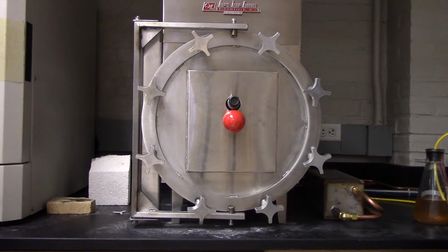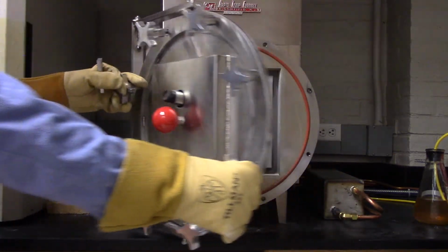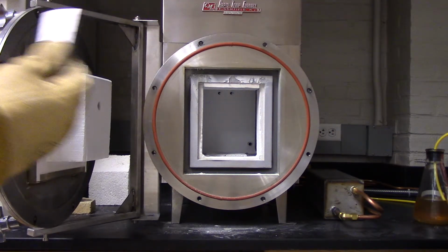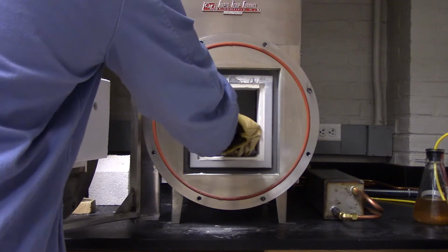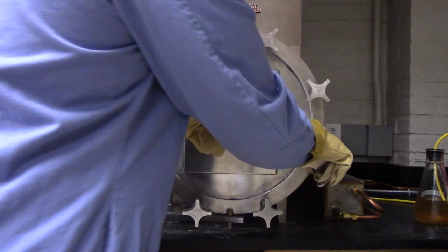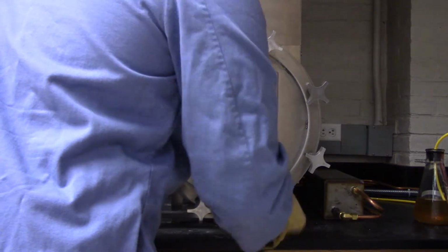So now that we've pretty much finished designing what process we want the furnace to take, we're just going to, following safety guidelines, open the furnace and put our piece of steel inside of there. Probably just put it right there. And then we're going to fully close this.